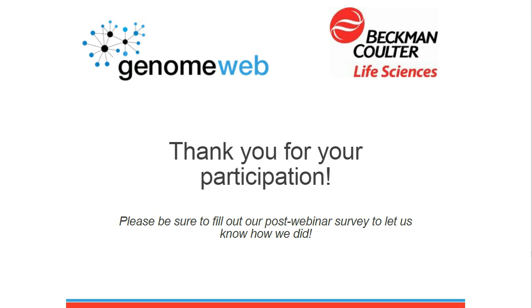Great. Thank you, Sohaila. So Sohaila, another question for you. How often should a user calibrate the Echo Liquid Handler? That's another good question. In fact, Echo is the simplest liquid handler I've used myself. It doesn't need any calibration. We do a focus check every week to make sure the system is still in good health, and it pretty much always is. If an instrument is getting old and anything concerns someone, that focus check every week will tell us if anything needs to be checked. Otherwise, that's basically a quality check just to make sure everything is in shape.